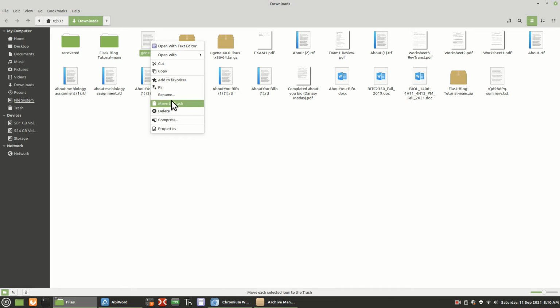So I'm going to rename that for myself because I would prefer to type that as FASTA. Alright, and it's GPX8. I probably ought to rename it as gene GPX8, and it is Homo sapiens. I abbreviate that. You could write human, whatever it is that you remember it as, but there. So that's the one I want.